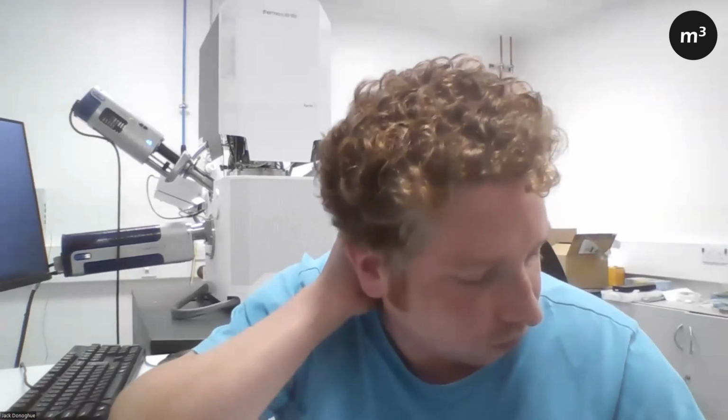Well, it's one of those that we get down to how much data is too much data. We can only stitch a data set together if it has fewer than 64 million pixels. But if you think about 64 million pixels, that's an awful lot of data. You're going to struggle to analyze that. So sometimes bigger isn't better. And when you get onto these very large areas, what is limiting you isn't necessarily your detector speed, because so much of the mapping time is taken up by stage movements. And that becomes a big factor in any of these scans.